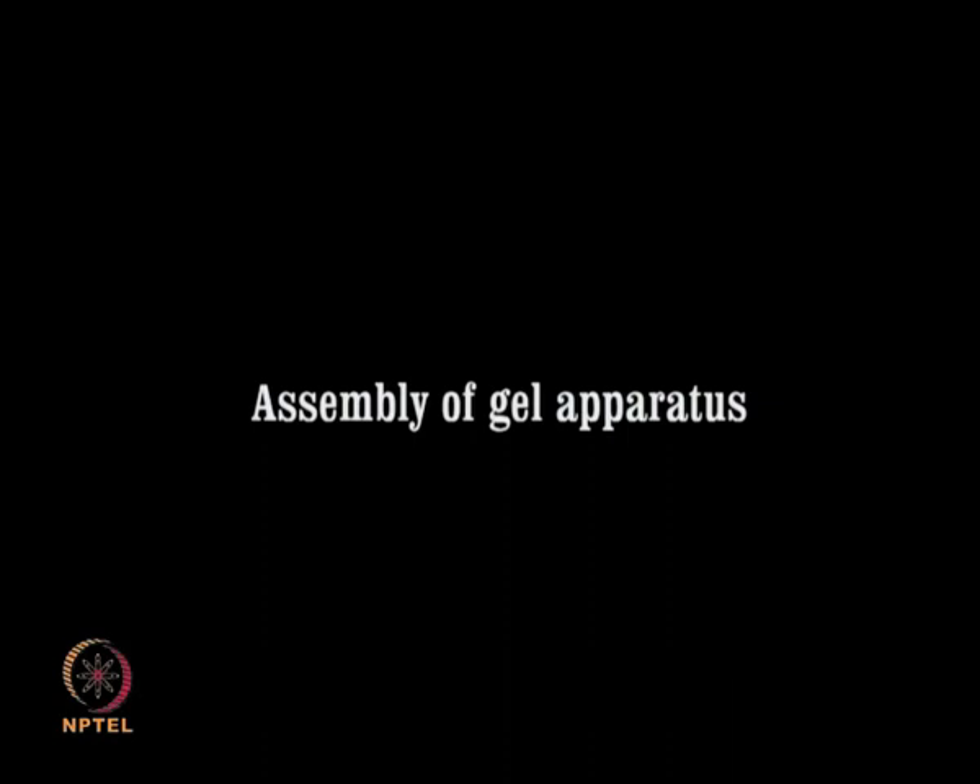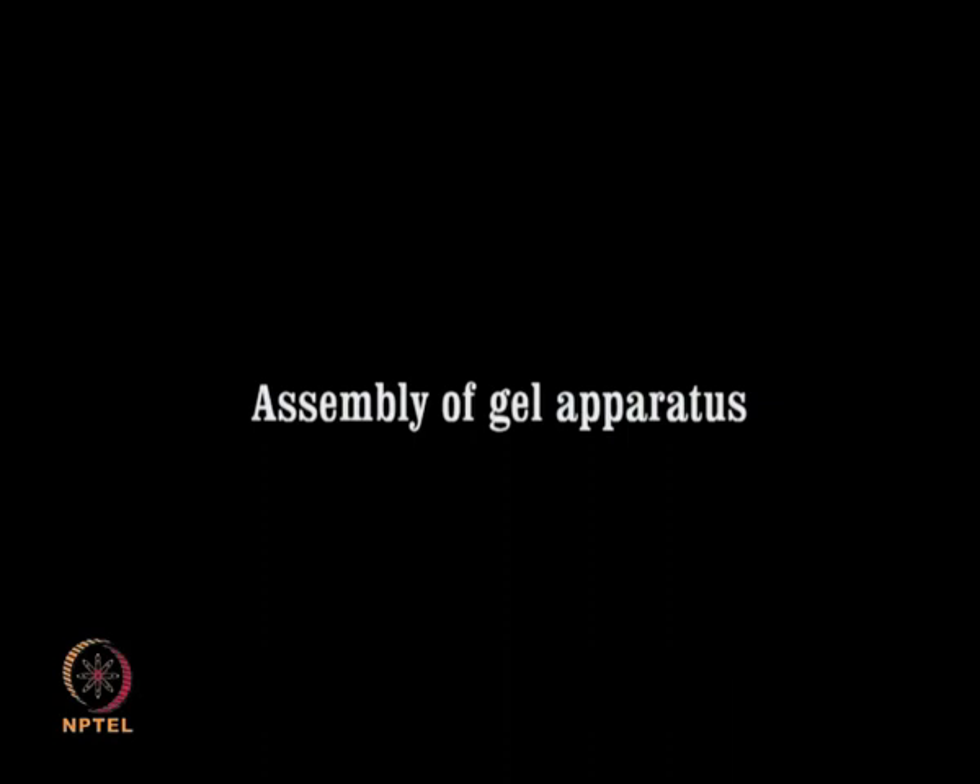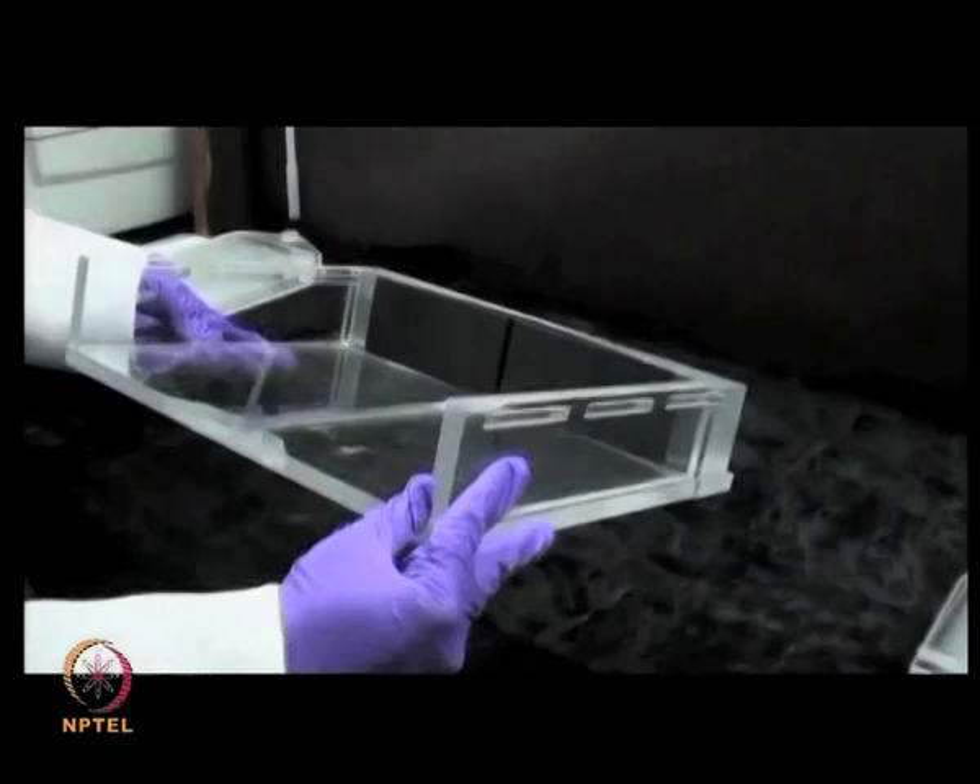Assembly of gel apparatus and gel casting. Clean all the components of the gel assembly thoroughly with water and dry them with paper towels.